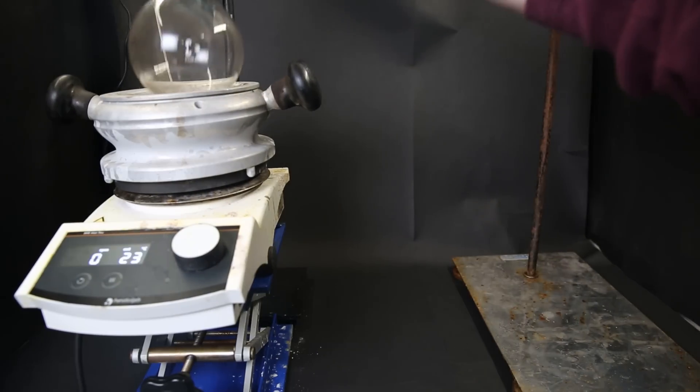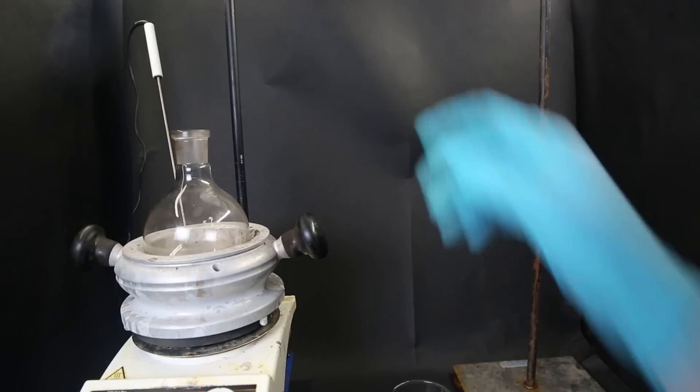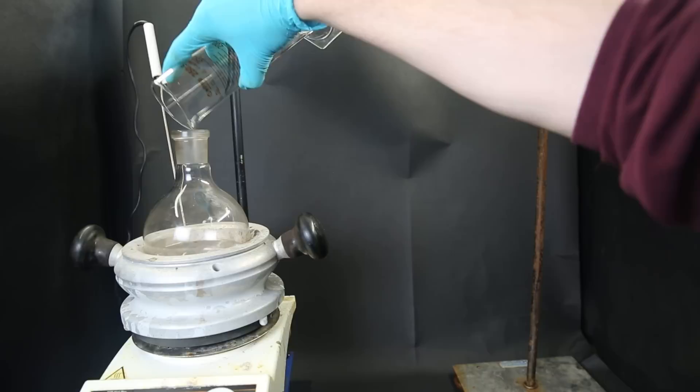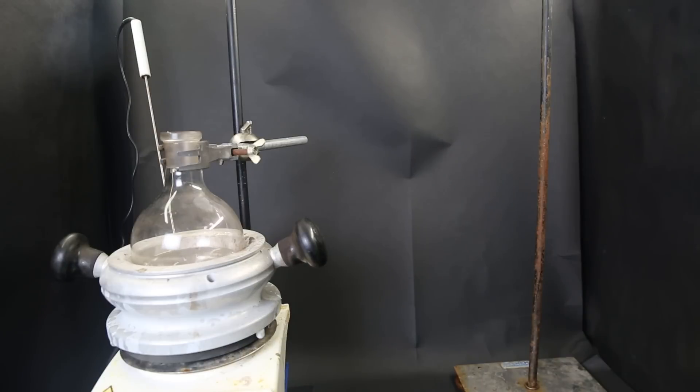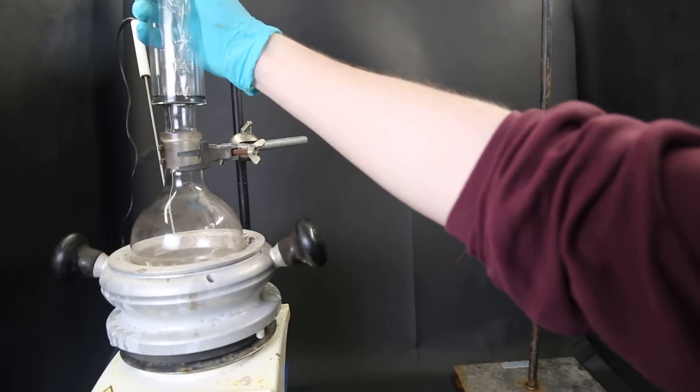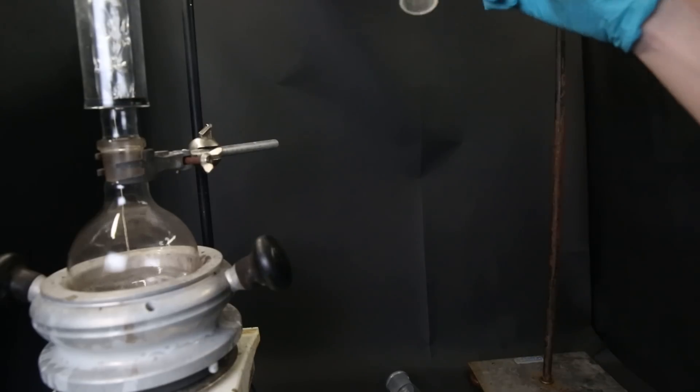So to start off, I set up a flask and drop in a stir bar. Then I add 125 ml of dicyclopentadiene to the flask. I then build a fractional distillation setup. Since the dicyclopentadiene will start to boil during the cracking, I don't want it to come over into the receiving flask.